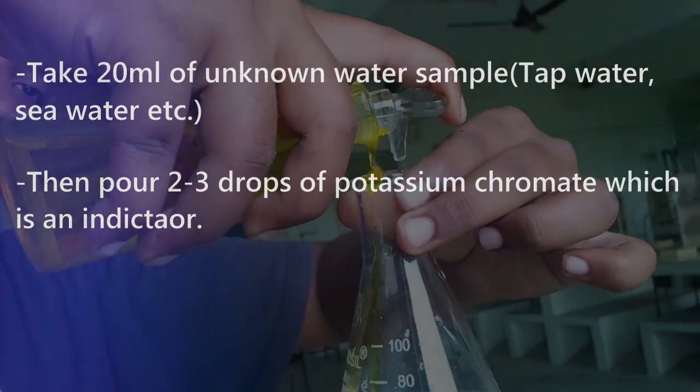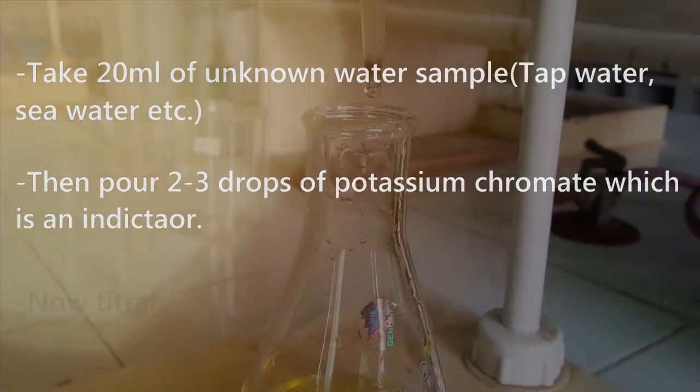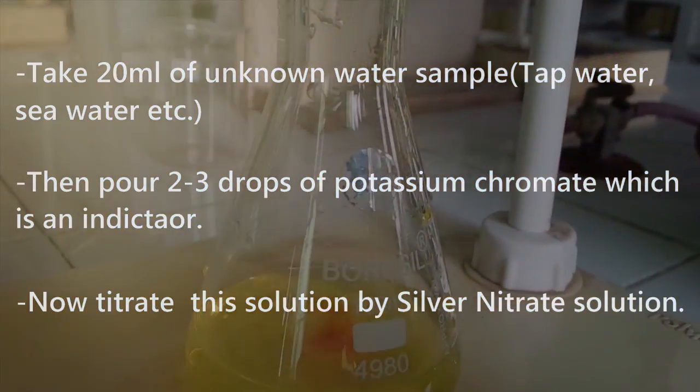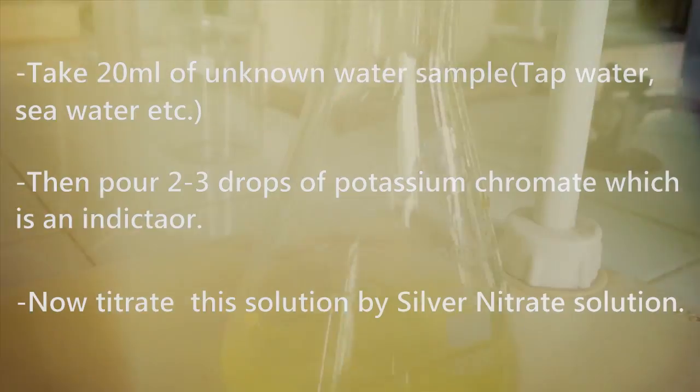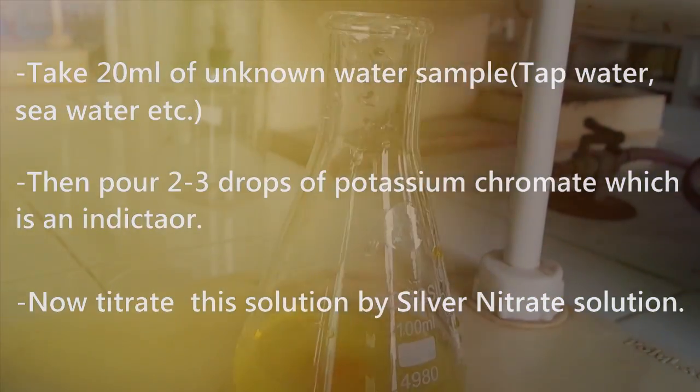Then pour 2-3 drops of potassium chromate which is an indicator. Now just titrate this solution by a silver nitrate solution. Repeat these steps up to 3 times to get precise reading of chloride content. So let's start.